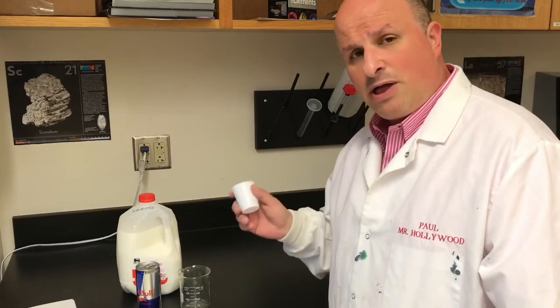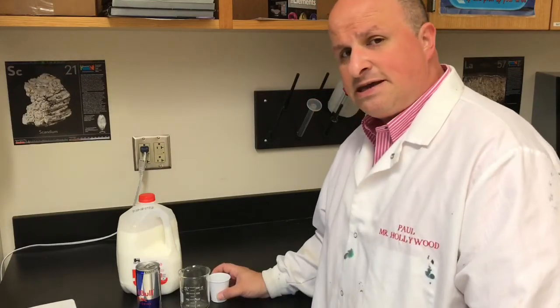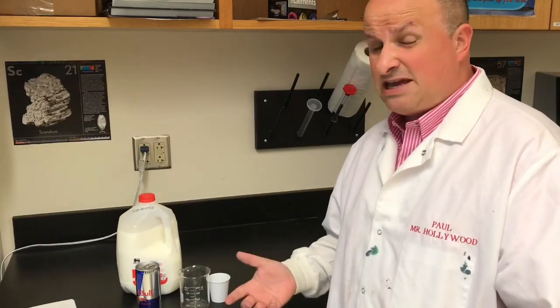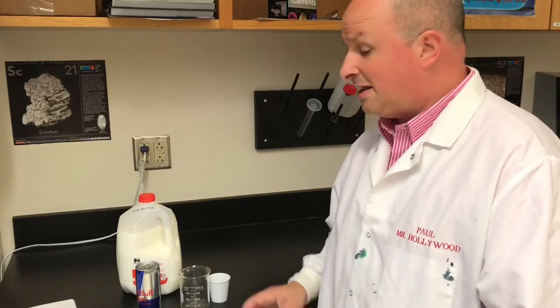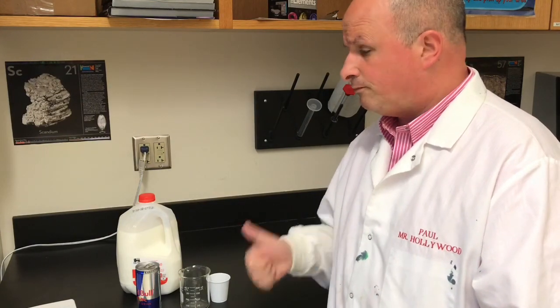You're also going to have a small plastic cup and a popsicle stick, and your job is to sample some of that precipitate and try to show some kind of evidence that it's not Red Bull or milk, but something different. And so you won't be able to use your sense of taste, but you can use other senses like sight and touch and smell to verify that it is not the same as Red Bull and milk, but something new. Safety for this lab is just going to be lab aprons, which are optional. You will not need safety glasses, and if you'd rather not wear the apron, you don't have to. Okay? All right, enjoy.